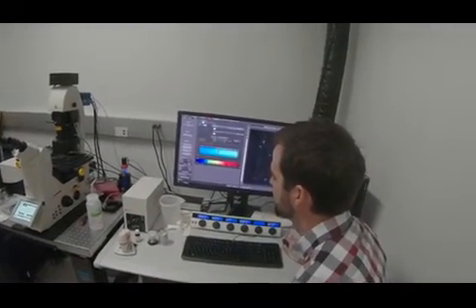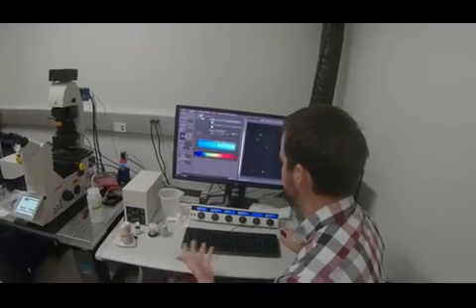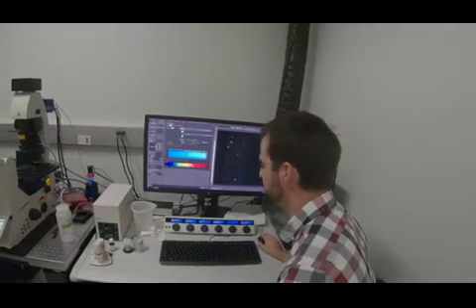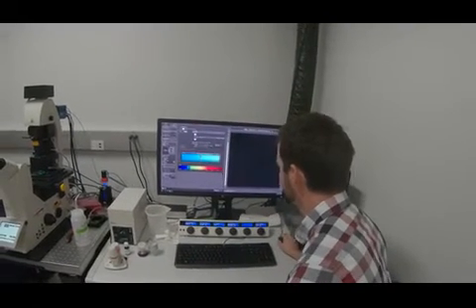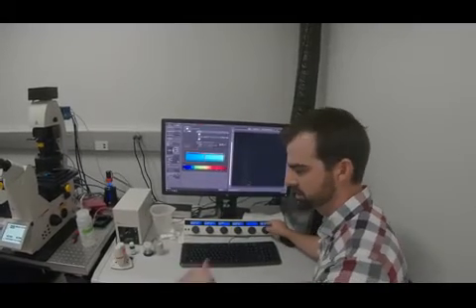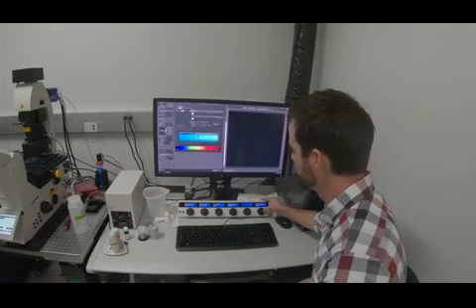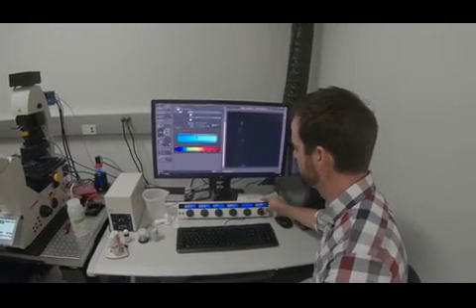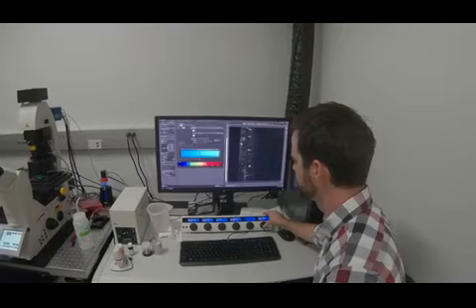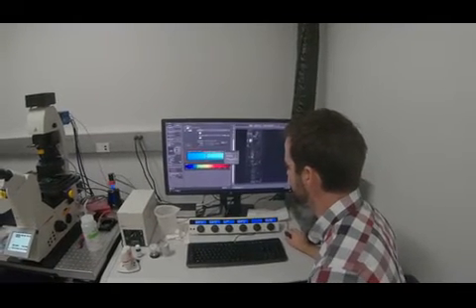We go to light sheet. That was a calibration step of the wizard. Now light sheet, this is where we set up taking images. Everything is set up now. And now to change your Z position, we're just going to use the stage, moving the stage up and down. So Z position sample, we can change the focal plane. View all the beads in there. And we can view it from the left and the right side.